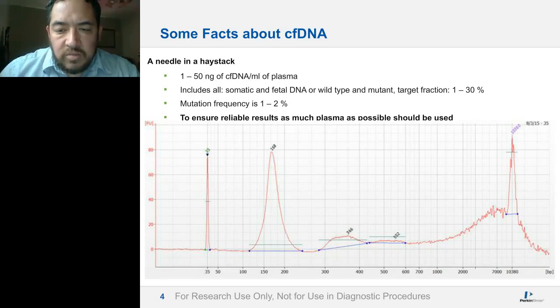Also, you see a little bit at the right near the high molecular weight markers, a little bit of genomic DNA, which is basically the challenge of doing this, in that the idea is you really want to have a good signal-to-noise ratio that will allow you to do a good downstream study. It's not enough just to purify it, but to really get a clean preparation from that.